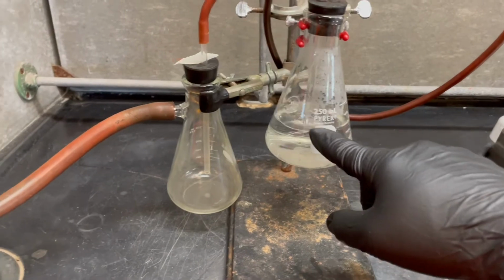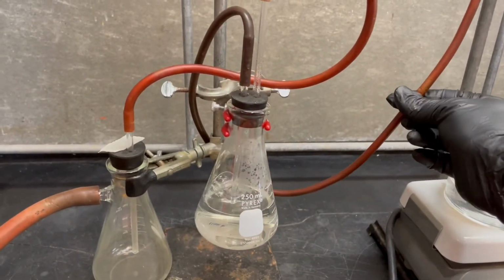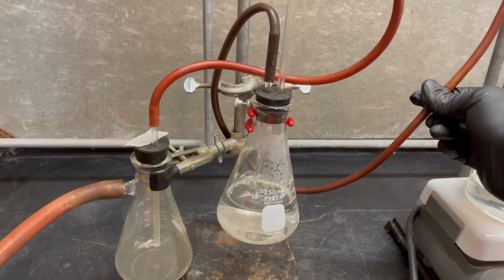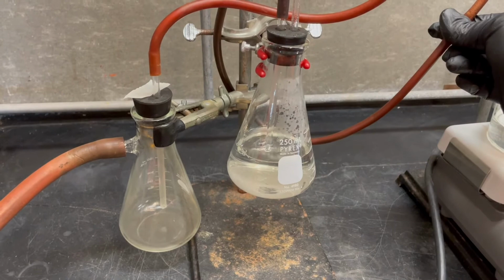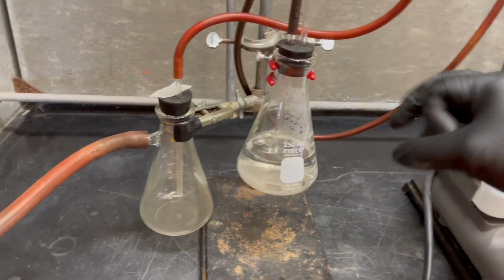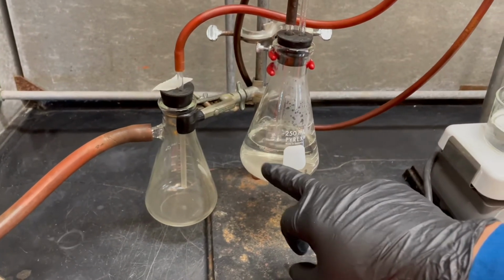There it goes. It's bubbling. It would bubble through here. So watch when I pinch this. It should stop the bubbles. It's slowing down, right? You can see they get crazy. Pinch, slows down. So it's gonna bubble the gas through this sodium hydroxide solution.